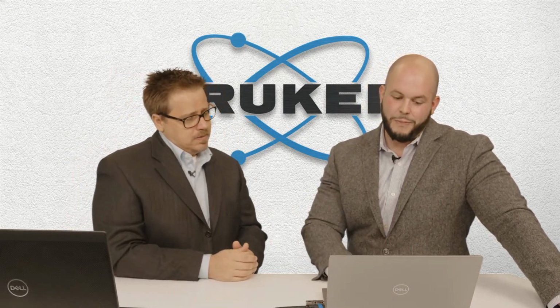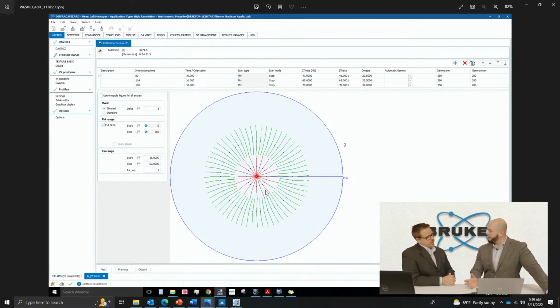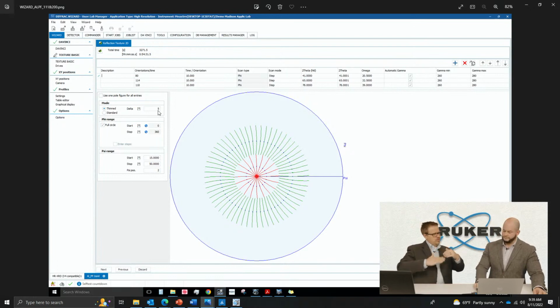Exactly. And again, the coverage here is solely up to what you're interested in, and what kind of resolution you want in the pole figure space. So each of those lines in the top of the table, that's going to be one set of measurements. Correct. Right? So these are exactly 3 different measurements, and you can see that the spacing, I try to keep pretty consistent between the rotations of the sample. So you want a little bit of overlap for the 2D detector, because you don't want to miss any information, but you don't want too much where then you're just wasting collection time.